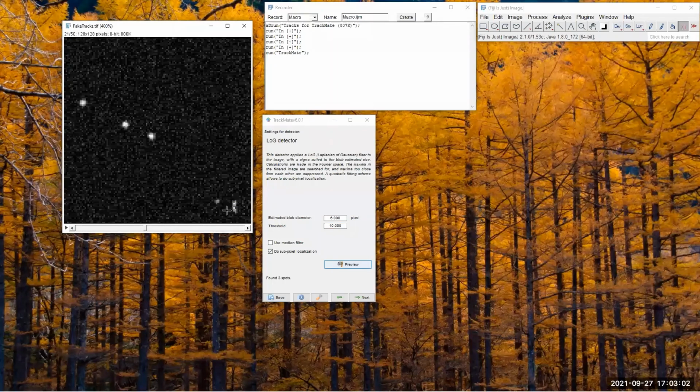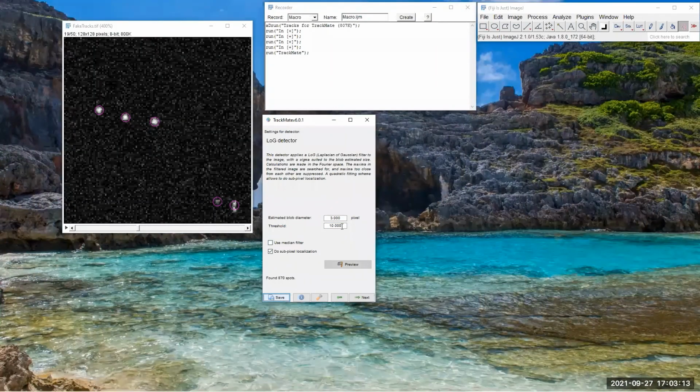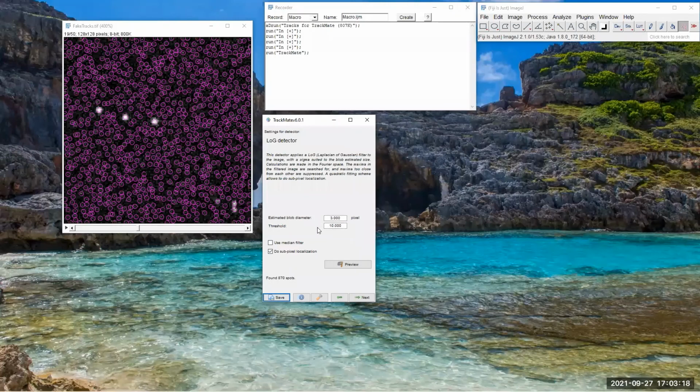But over here, you can see that it doesn't really pick up. It should be 2, but it's picking it up as 1. So maybe my blob needs to be smaller. When I make the diameter smaller, you can see the threshold probably needs to be a bit higher. Otherwise, it detects the other stuff.